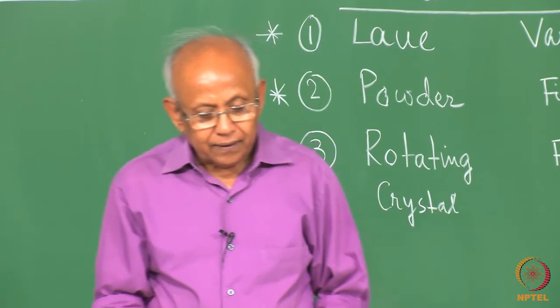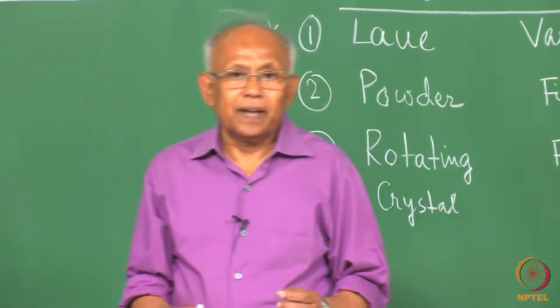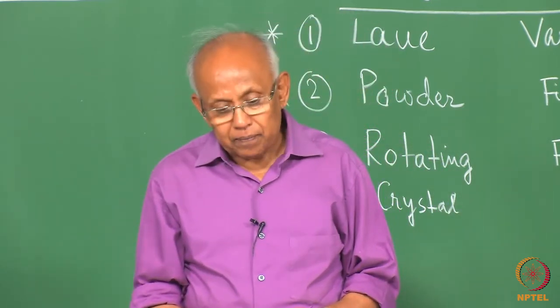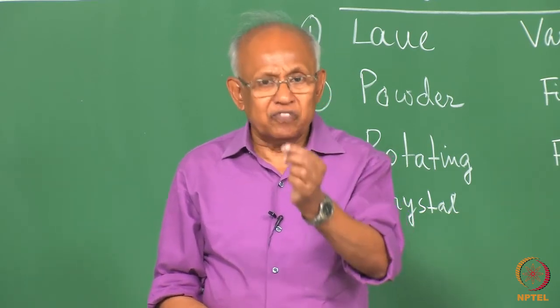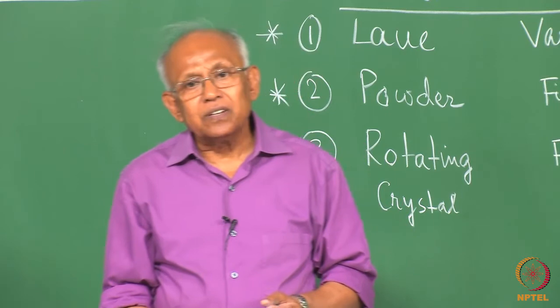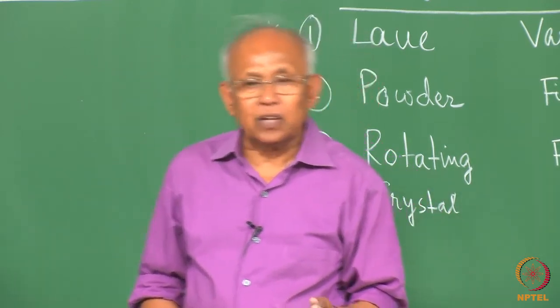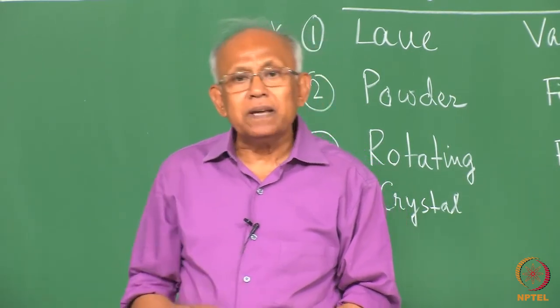The other method is you produce some powder from the polycrystalline sample, then take some very thin walled glass tube made of a non-absorbing material like cellophane or lithium borate glass, and fill it up with the powder.